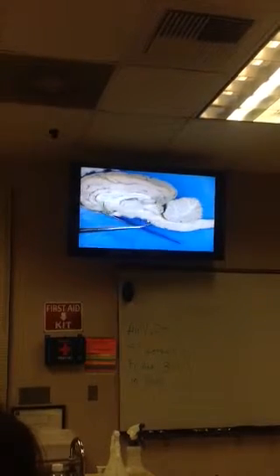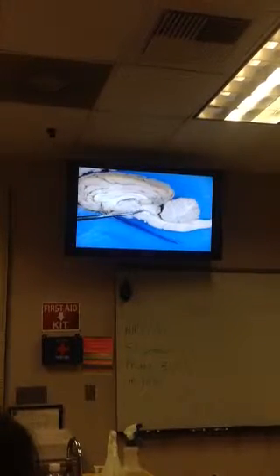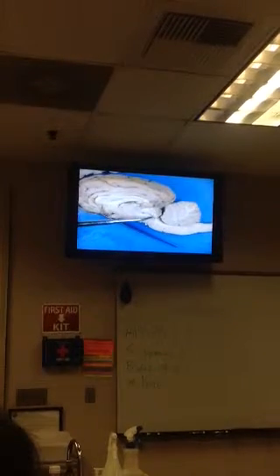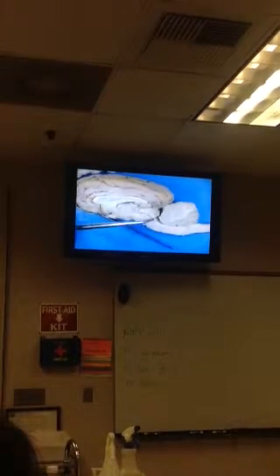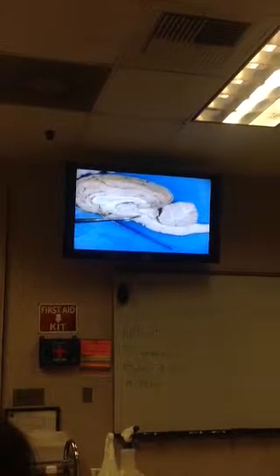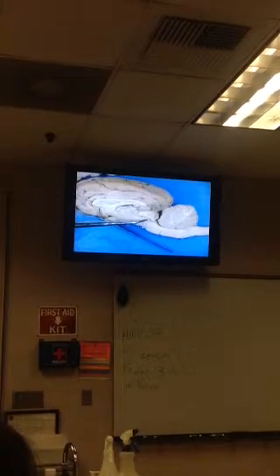And there's a lot of structures you see there that are listed as part of the midbrain. You see the channel that runs through it? That's the cerebral aqueduct. Runs through the center of the midbrain, connecting the third ventricle to the fourth ventricle down below it. Now, in front of the cerebral aqueduct, this region of the midbrain are called the cerebral peduncles.